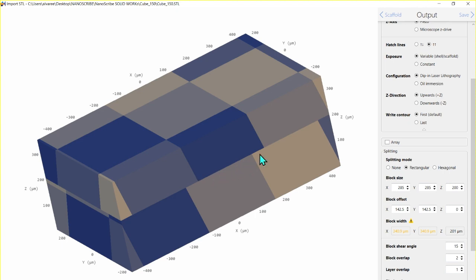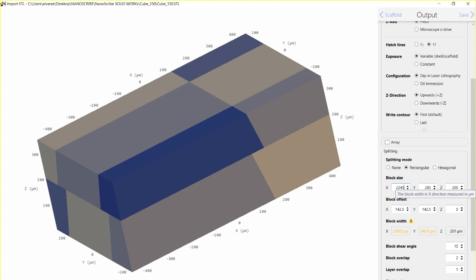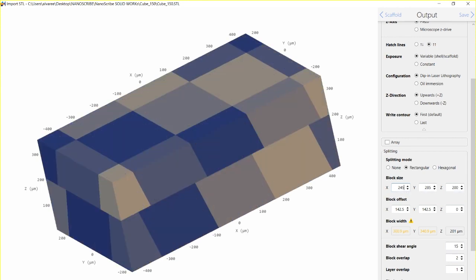And because of this angle, you can see that the final size, because if we take the measurement from here till here, and we write a straight line, this final size is bigger than 300. Okay? So we need to reduce this size until even less, 245. Oh, too much. 245.